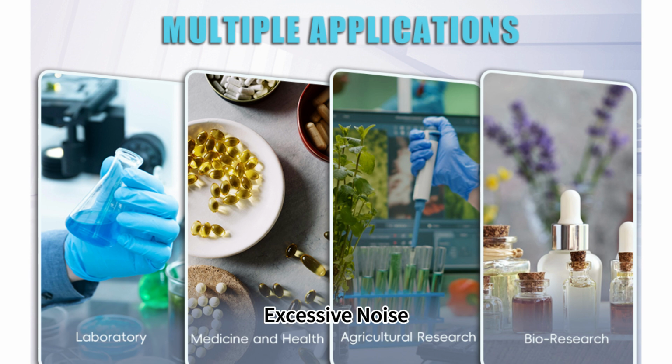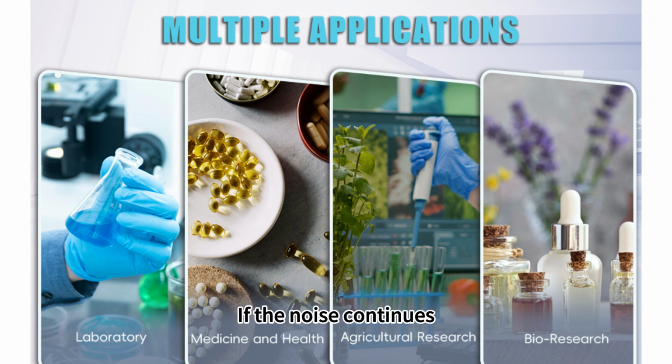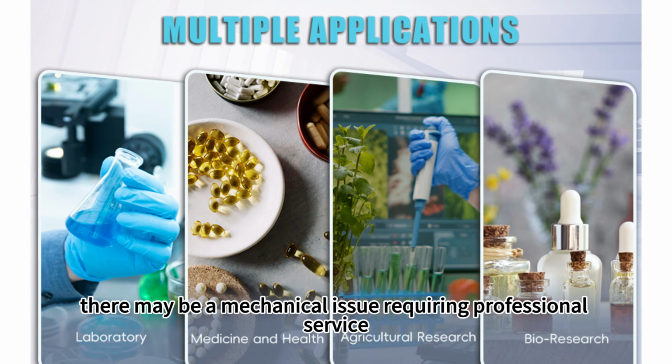3. Excessive noise. Solution: tighten any loose screws or parts. Check for debris or foreign objects that might be causing the noise. If the noise continues, there may be a mechanical issue requiring professional service.